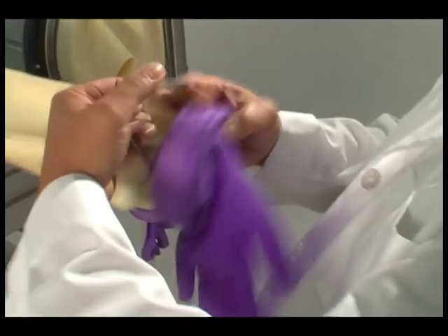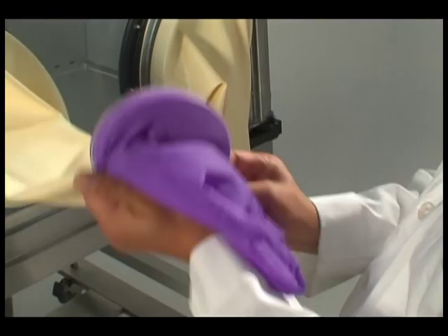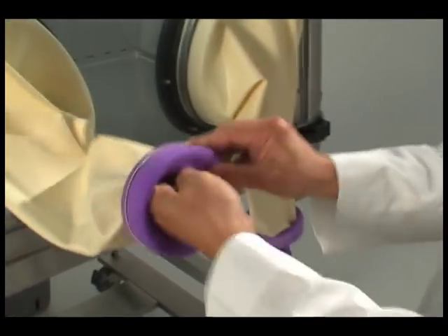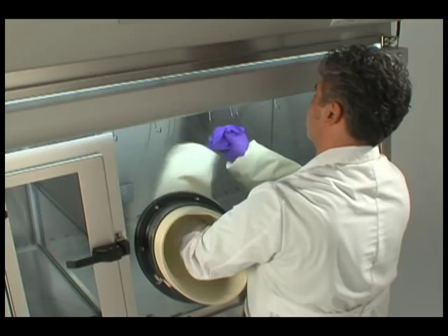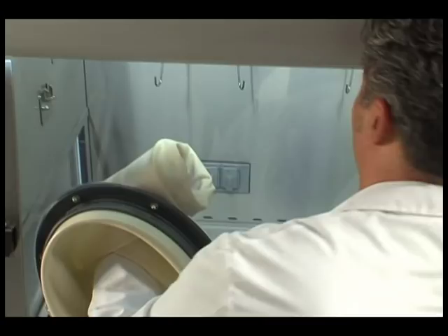Replace the stainless steel garter spring over the new glove and into the second groove. Using the other glove hand, pull the old glove off and dispose of as trace chemohazardous waste.